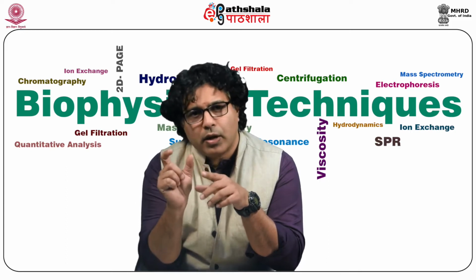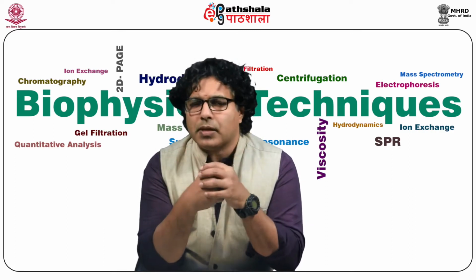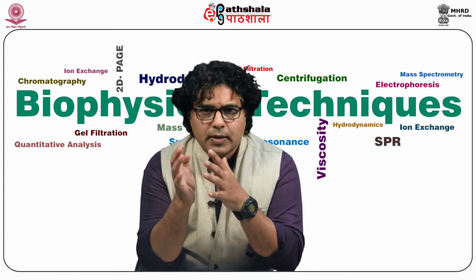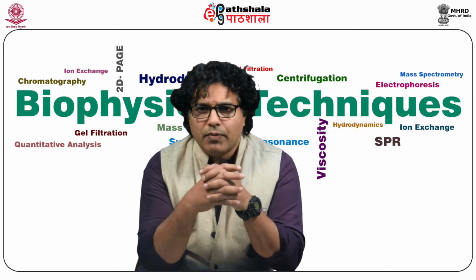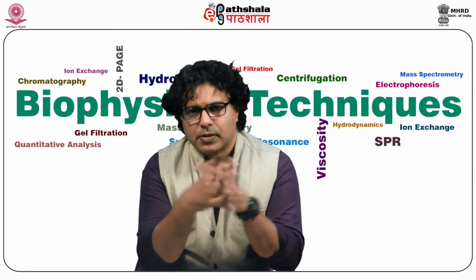With just holding the choline in quadrupole 3, we look for the precursors of the ions. So these kinds of experiments confirm which molecules are giving a constant fragment ion. Whenever we do subspecies analysis, where there is a commonality, the fragmentation pattern helps us to see similar species.